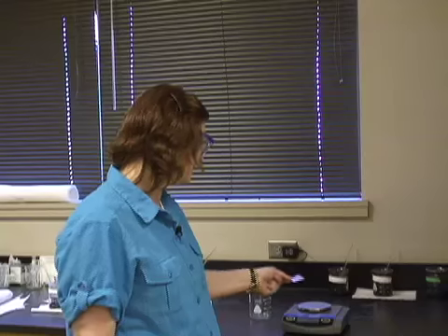Here we are in the lab. Oh my goodness, I'm so excited. The first thing we have to do is weigh out 0.50 grams. The lab may say 0.0000, but that would be in a college level class where we have an analytical scale. So we're only going to go to the 0.01 place, which is the hundredths place.